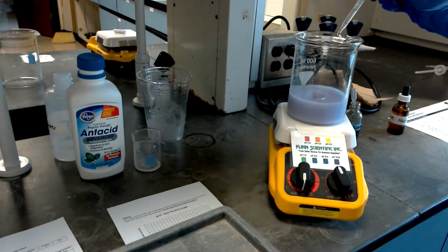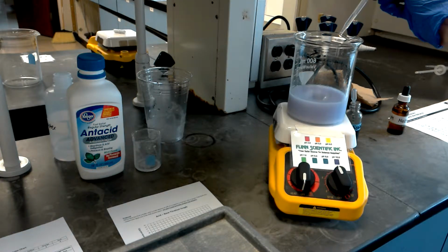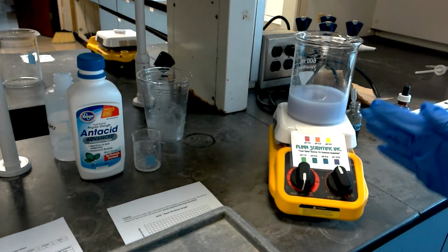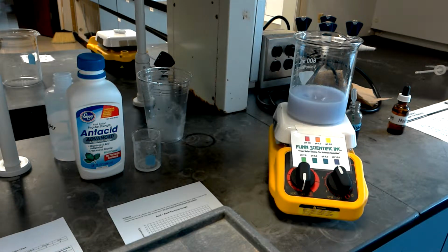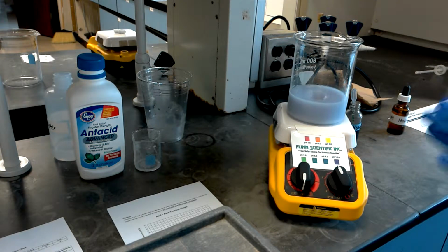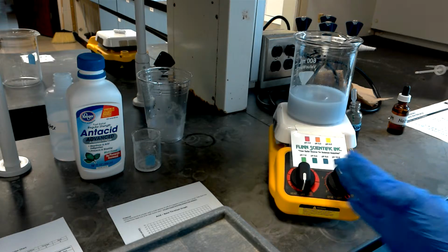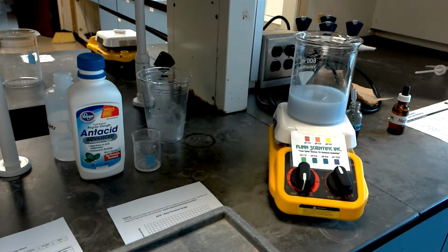So we're going to have to do a few drops to get ourselves down to the 10 mark and start seeing some colors. So now we're at 6 drops, and you can see it's starting to go a little bit more from the purple towards the blue area. 8 drops is definitely more towards the pH of 9. 10 drops of hydrochloric acid. Now we don't see a whole lot of the purple anymore at all, and we're definitely in a lower pH.